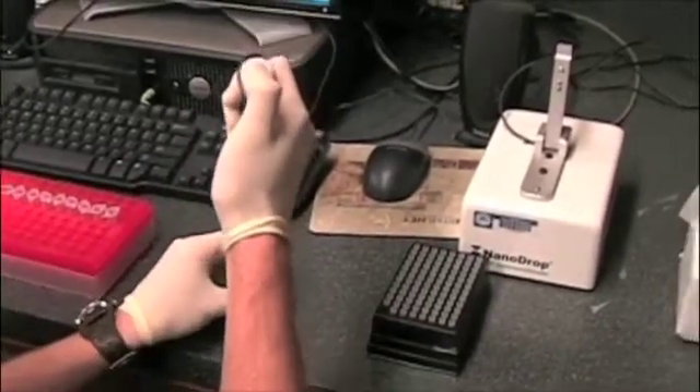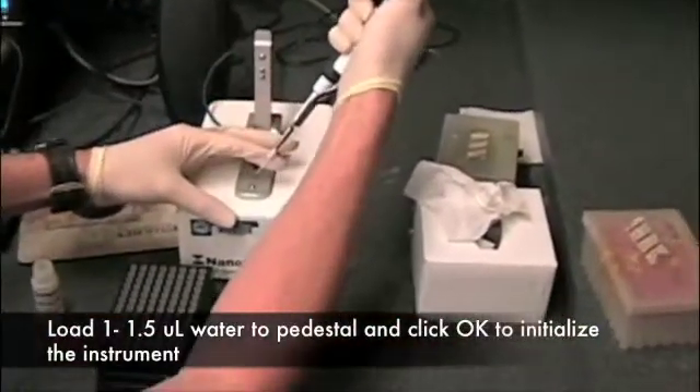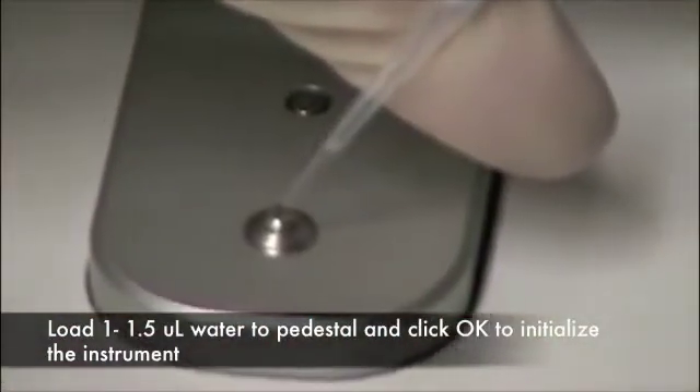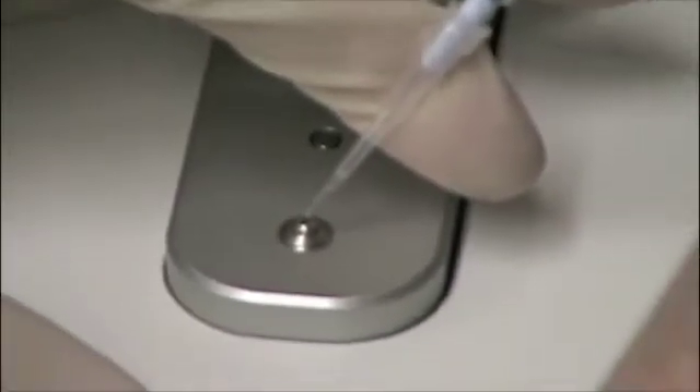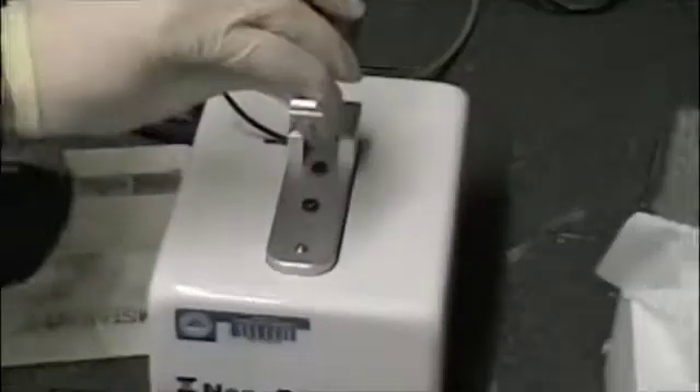1.5 microliters — simply get a microliter out of the tube. Right on top of there, we add a little drop. There's a little drop now on that bead, and then we lower the arm.